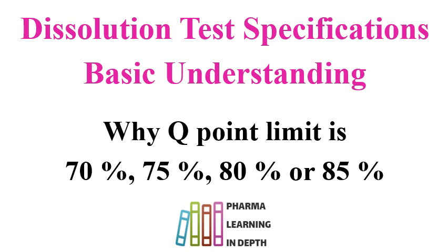as we give the label claim and we denote it by testing assay, that is 100%, and the limits for assay or potency are 95 to 105% or 90 to 110%. But if you consider the dissolution Q point limits, these are generally given as 70%, 75%, 80% or 85%, and Q is denoted as Q is equal to not less than 80% or 75%, 70% or 85%.